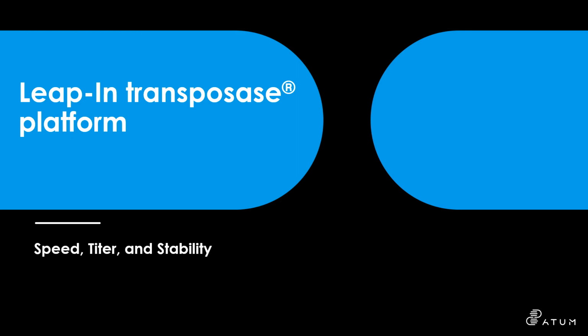What I'd like to do today is tell you about the leap-in transposase platform that we have developed at ATUM and how we've applied this to the development of stable cell lines for the manufacture of protein biologics.